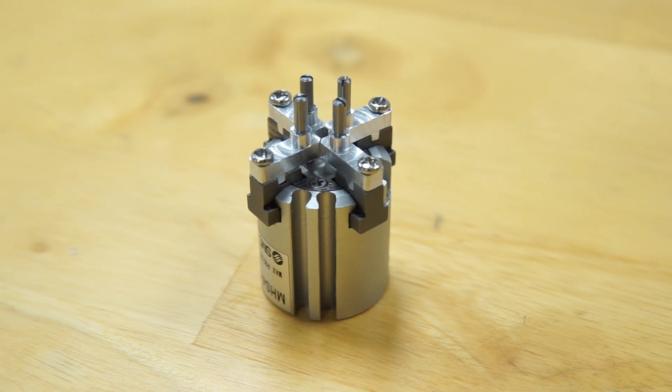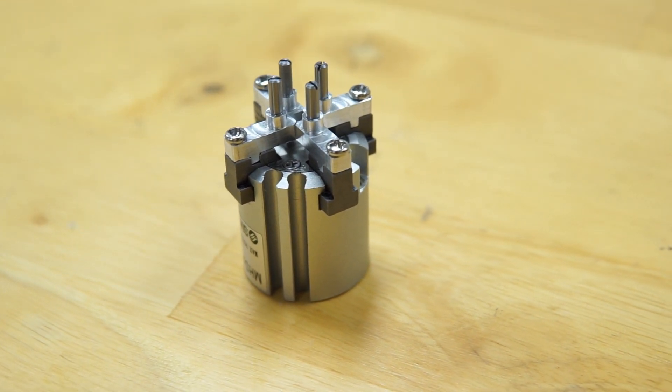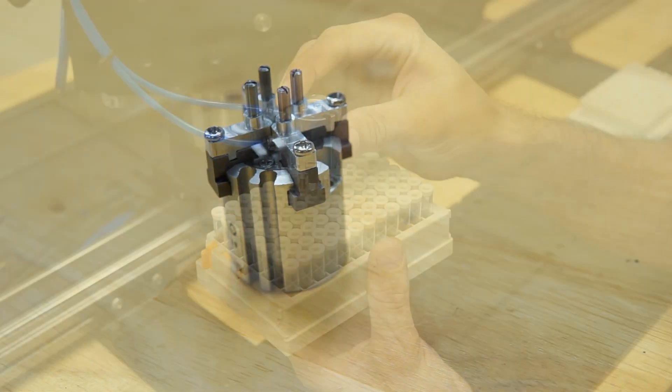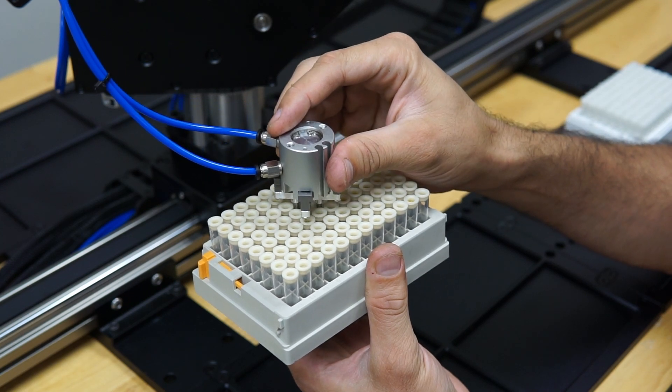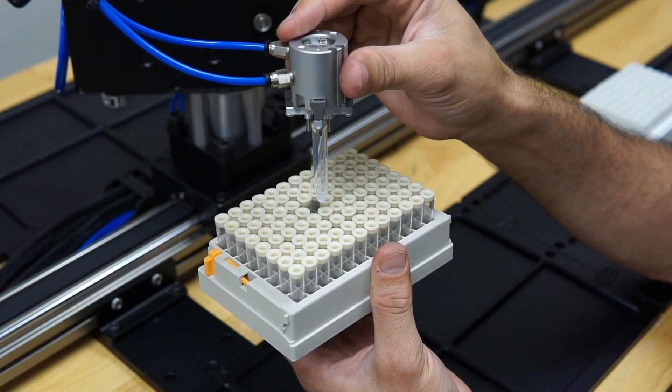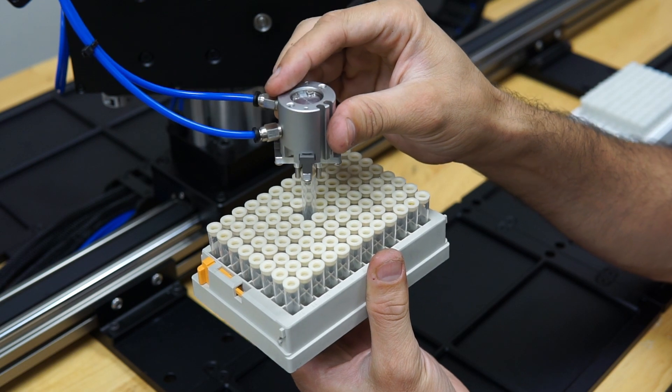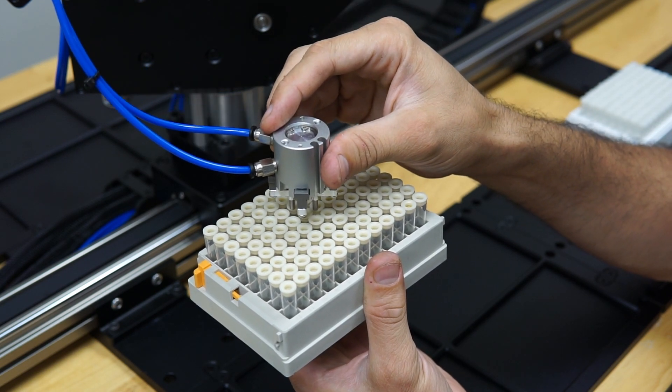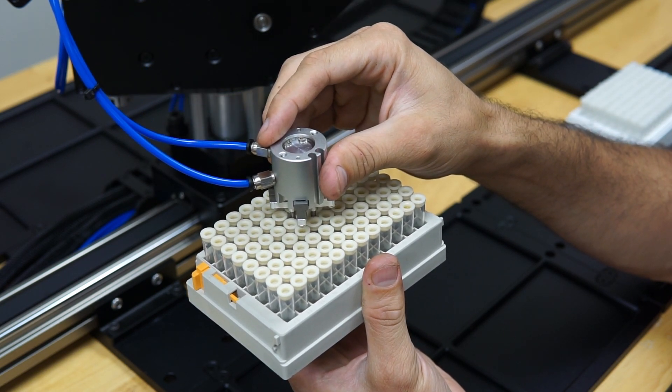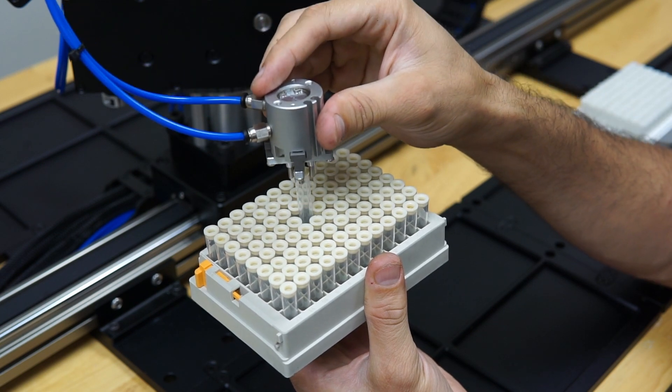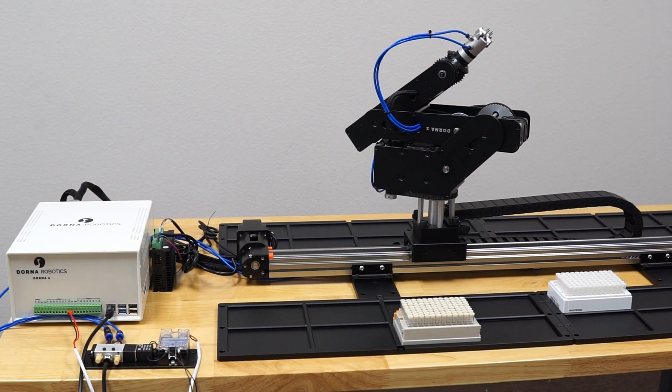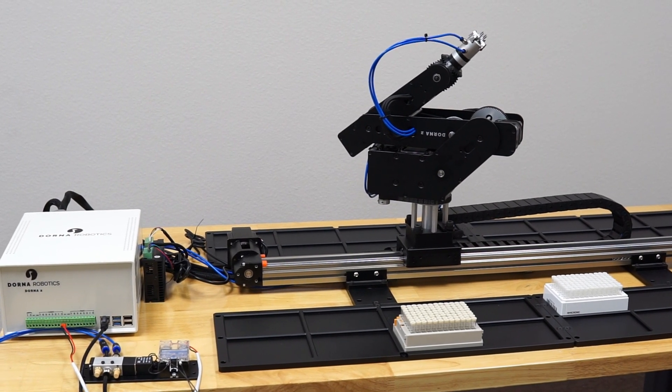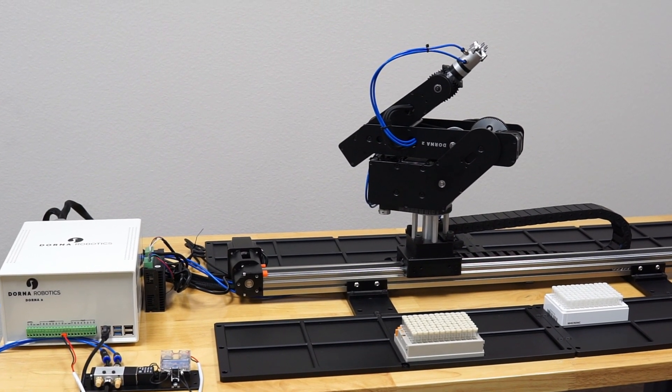Here is the final assembly of the gripper. Now that we have all hardware components made and assembled, it's time to program the robot.